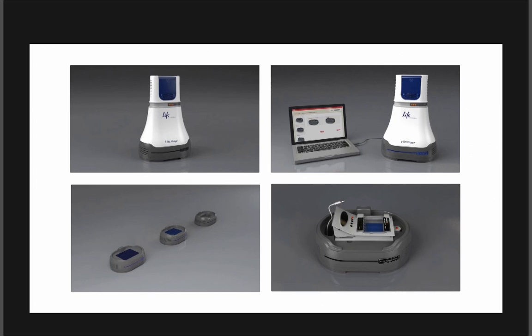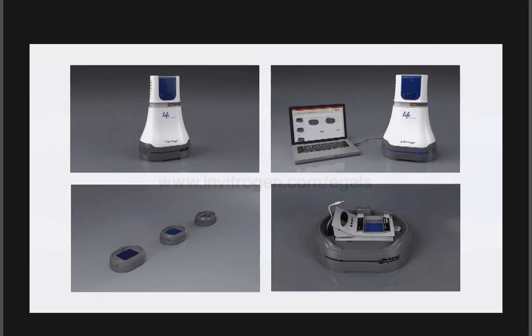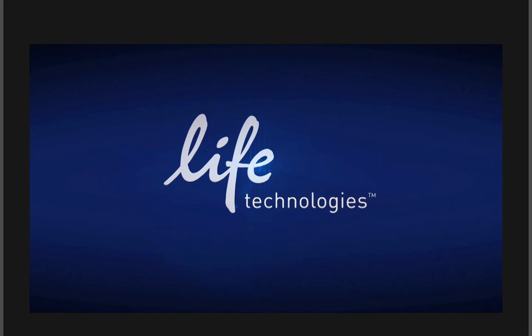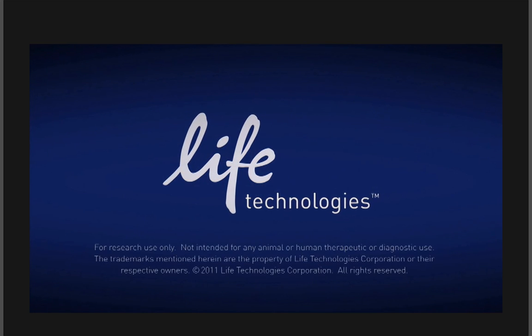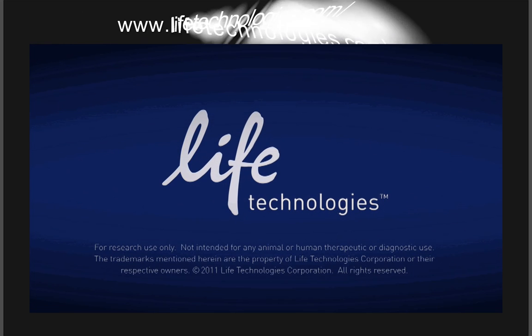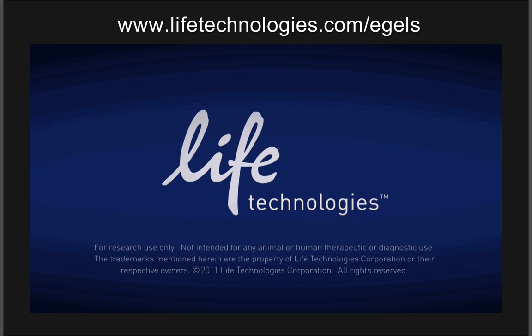There are numerous imaging features not shown in this video, including zooming, scrolling, real-time multi-imaging, sensitivity, brightness, and pseudo-color. For more information on the eGel Imager system and related products, please visit www.lifetechnologies.com forward slash eGels.